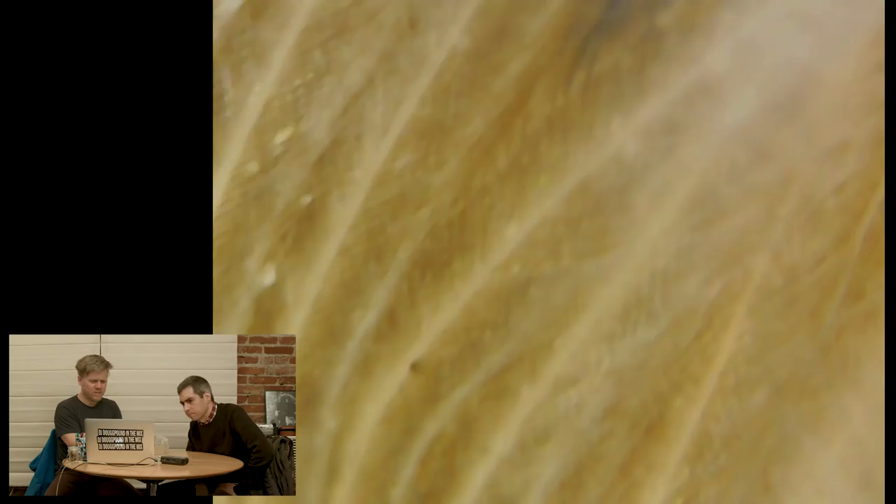Feathers are pretty elegant things, aren't they? Yeah. Want to try to go 1000x on it? Most definitely. When you go 1000x — ooh, there it is. The yellow tip. There's the yellow tip. Let's look at this fuzzy stuff. Shall we put this against a white background, perhaps? It's fuzzy stuff.